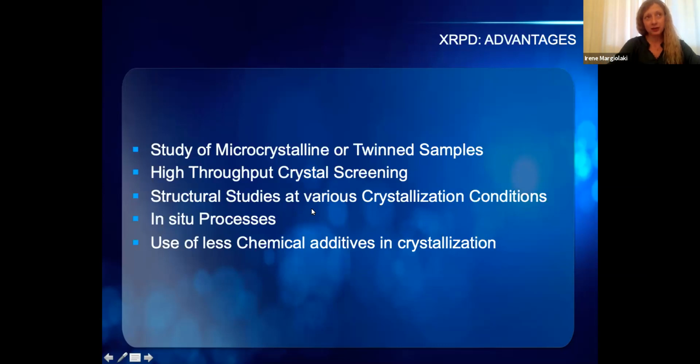This is a tendency, again, from the materials science world. We want to see not only the structure of a protein molecule at a specific set of conditions, but also to observe how the protein structures behave upon variation of their physicochemical or biochemical environment.